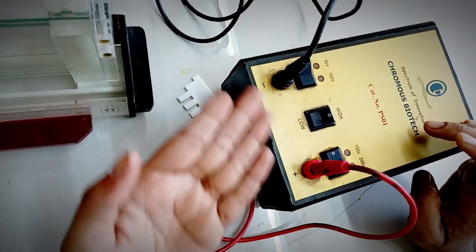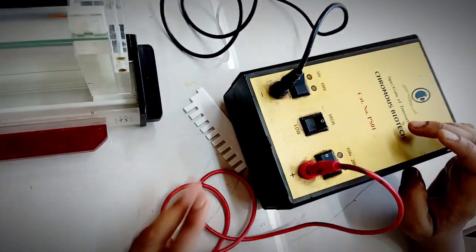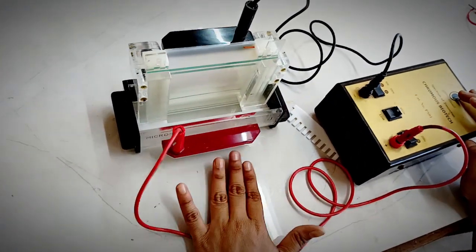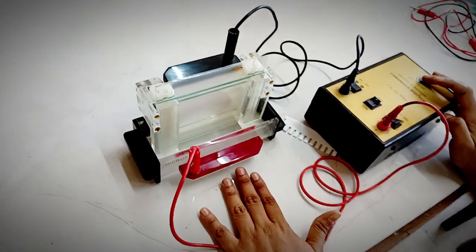So here you can see these are the electrodes, negative and positive, black and red, and you are supposed to attach them. So this is the whole setup for vertical gel electrophoresis apparatus.